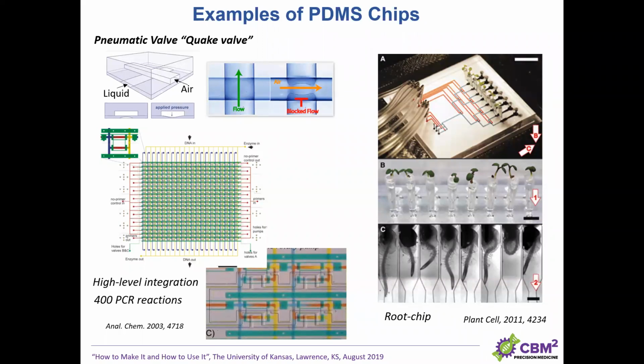This is one of the earlier applications, where 400 PCR reactions were done in this multi-layer integrated system with a lot of valves. So this application is molecular diagnostics.